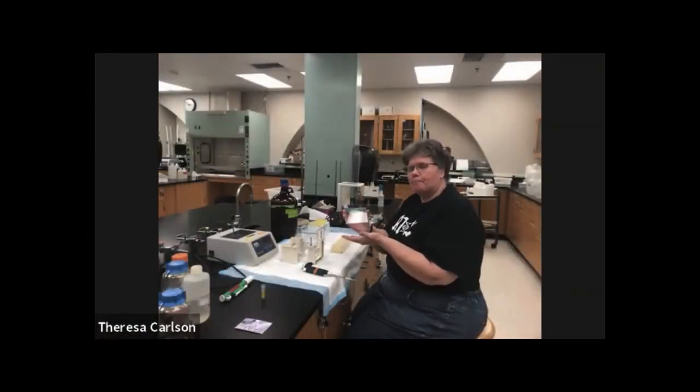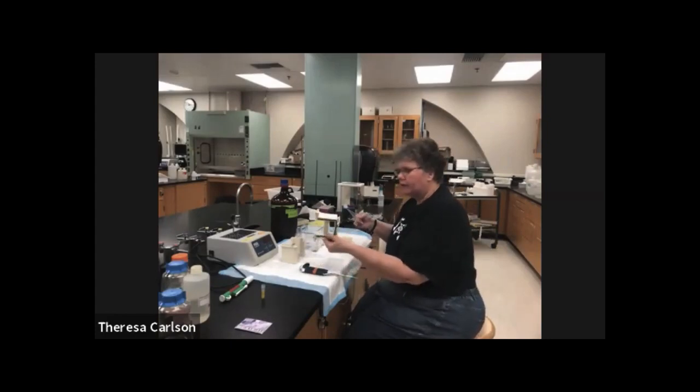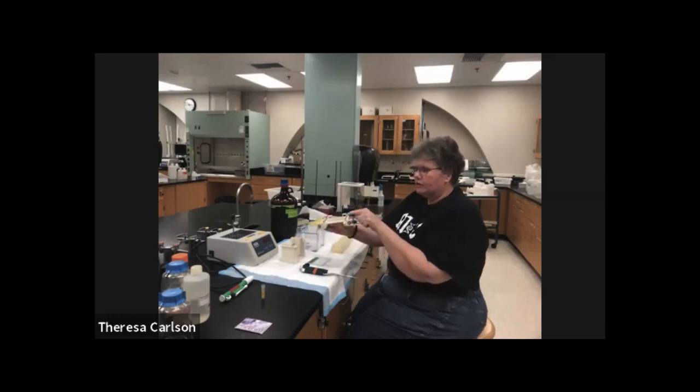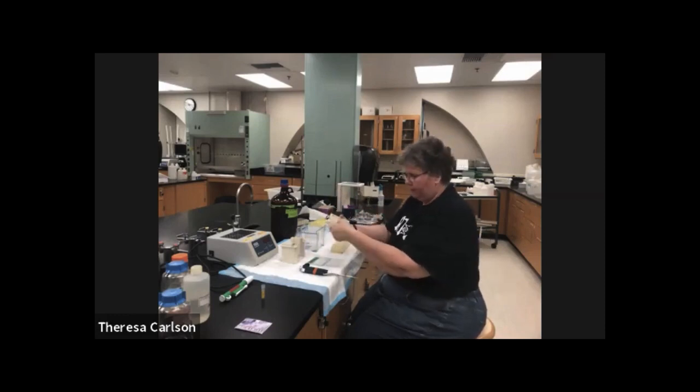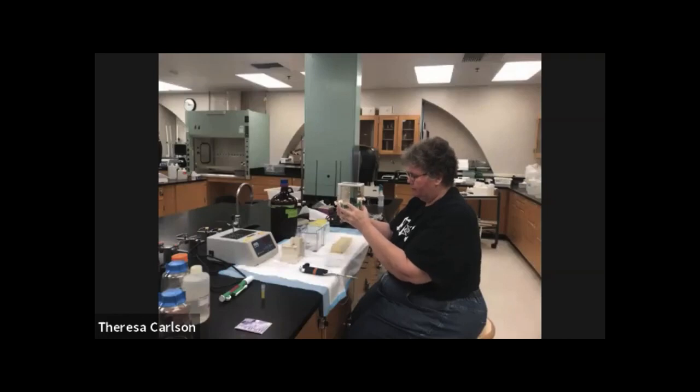So we have unwrapped our gel from yesterday, taken it out of the moist paper towel and Saran wrap that preserved it, and we're going to set it up to run. So here we have the interior assembly, and there's these little feet on the bottom. You put the smaller plate towards the inside, because there's a large plate and a small plate. You have the small plate towards the inside all the way down on these feet right here.